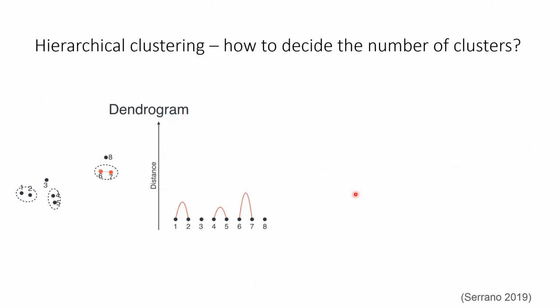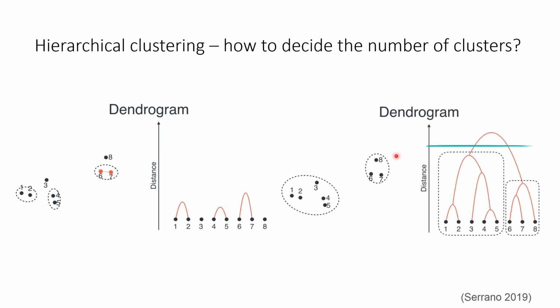So how do we decide what this distance threshold is and how many clusters we want to end up with using a computational approach? So if we plot the pairwise distances, starting with the closest and adding the distances between groups as we merge groups, we simply draw a line at some predetermined distance. And in single-cell RNA-Seq data, it is a standard practice to adjust the number of clusters to match your expectations.